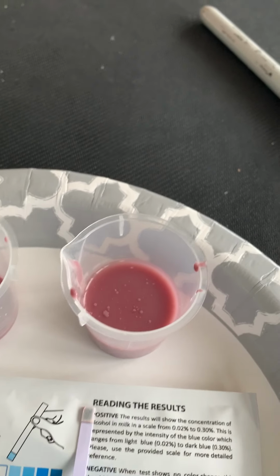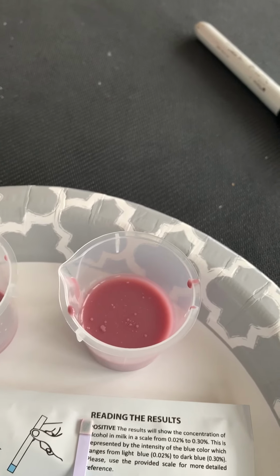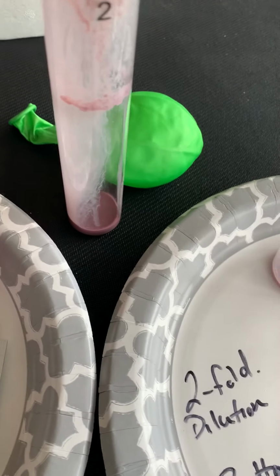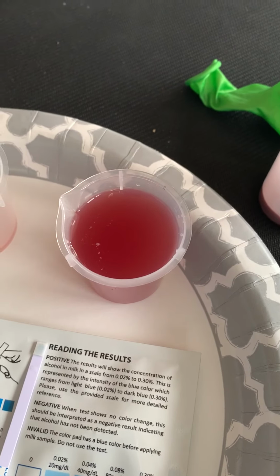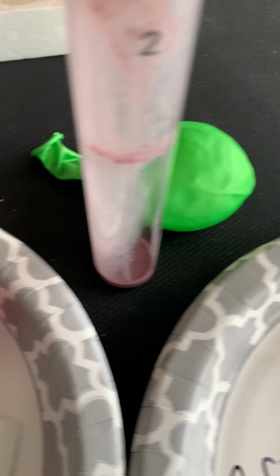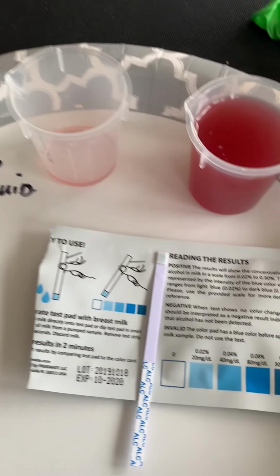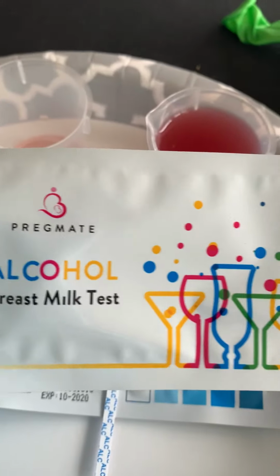Obviously it's more dense, probably consists of yeast that was reacted and unreacted, as well as any other fluids that may have been produced. And so what we did here is we had the top fluid, as I show here, separated from the bottom fluid. So we emptied that vial, and then I did a twofold dilution, and then I submitted that to a test using this alcohol breast milk test.